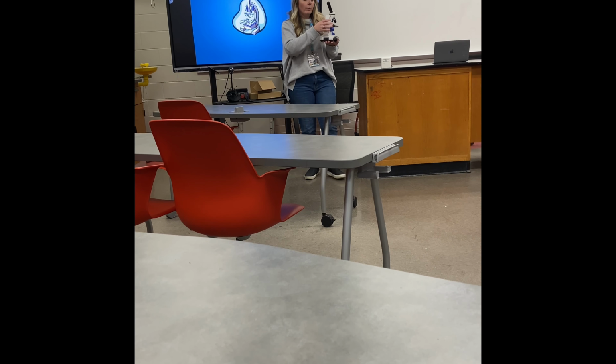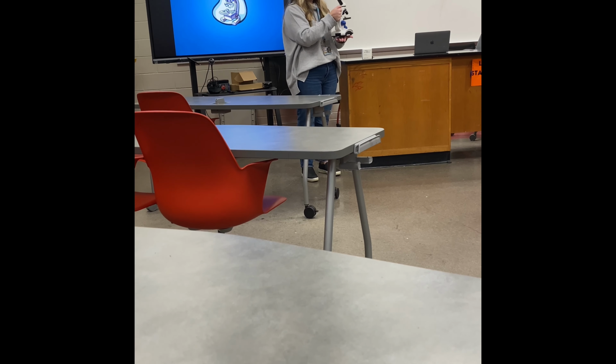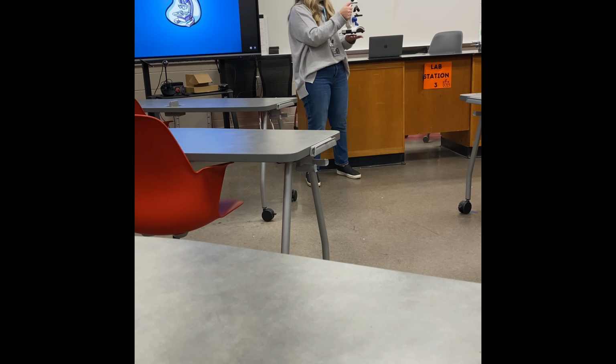So, the microscope has what we call an arm, which is right here. These conveniently have a handle on them for you to be able to pick them up. These are pretty light, but they're very expensive, and we need to be sure we take care of them, okay? They also have a base on the bottom. This is the base. We need to carry them by the arm and by the base, okay?